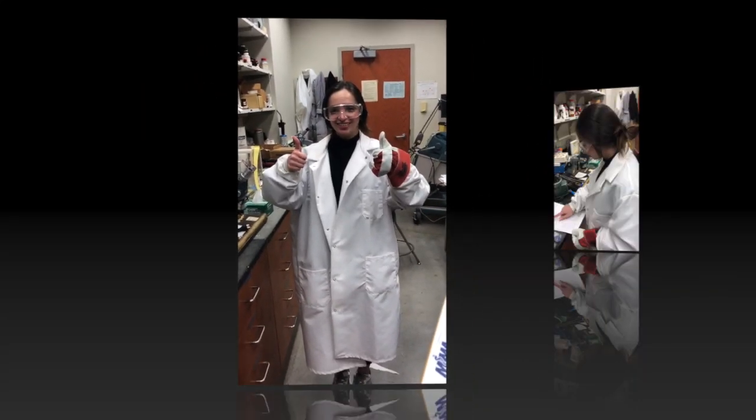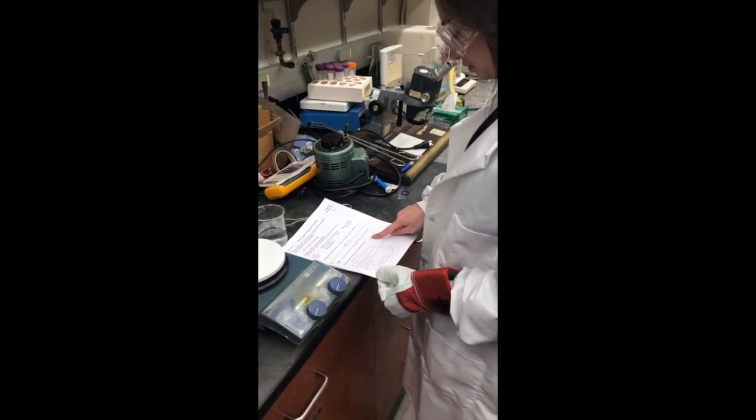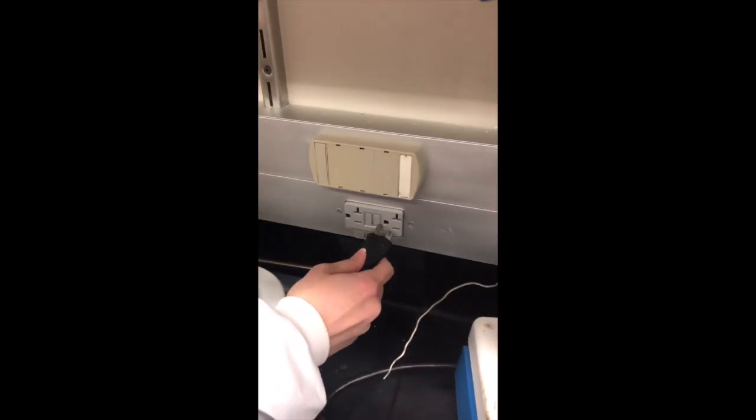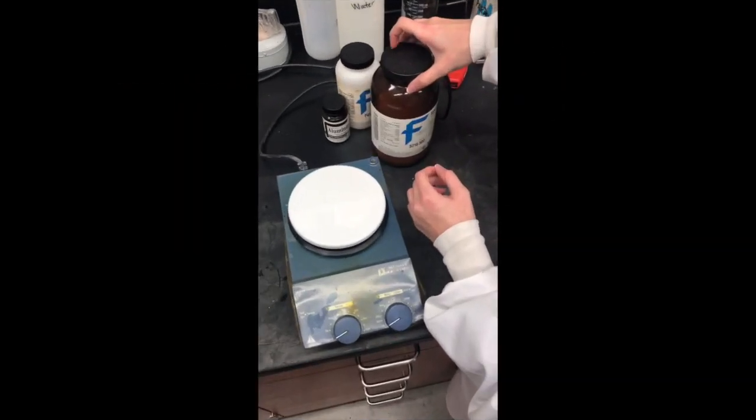Make sure you always wear proper safety gear when in the lab. Make sure to read the instructions carefully. Make sure you plug in the hot plate. Make sure your wire isn't tangled and touching the hot plate. Make sure to keep your workstation nice and clean.